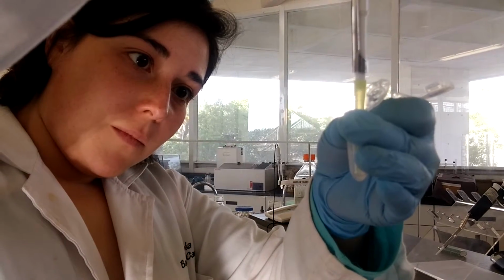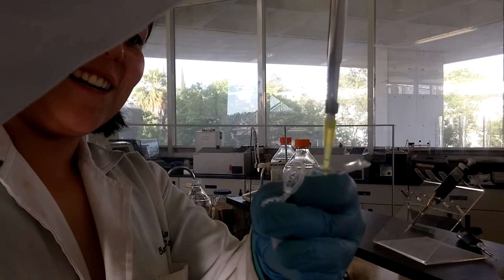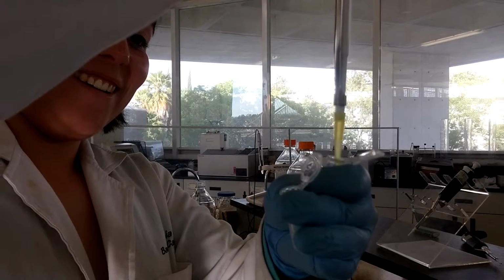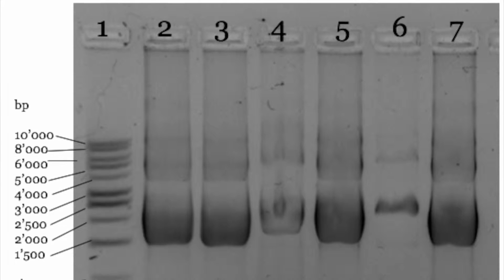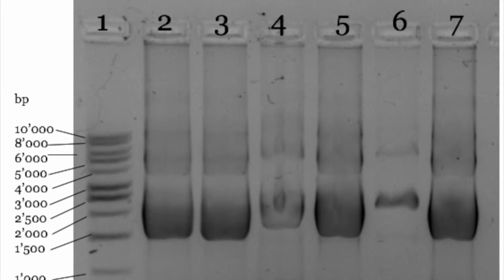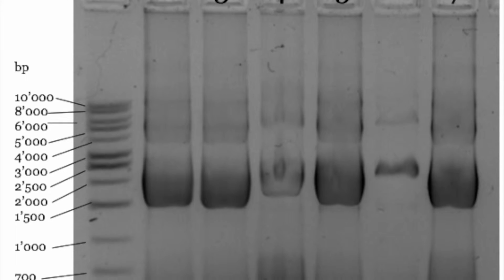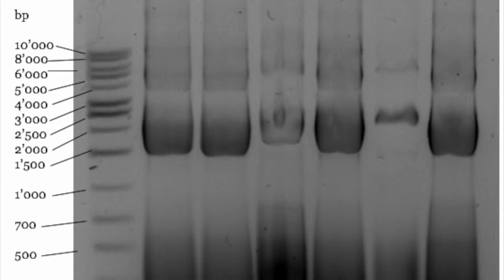Plasmid can be visualized on agarose gels in 3 different forms: supercoiled, relaxed, and linear forms of full length. The gel consists of 7 lanes. The first lane is the 1 kilobase DNA ladder from Invitrogen. Lanes 2 to 5 are the lanes from the other teams of Group 3 of the Laboratory of Genetic Engineering.